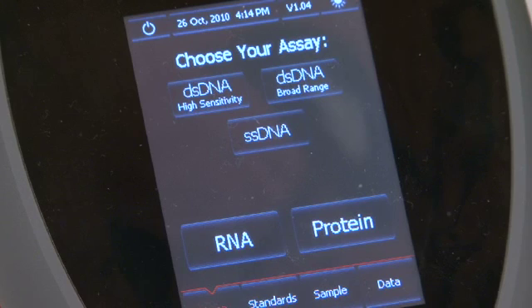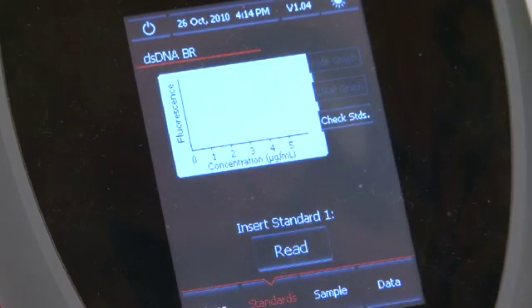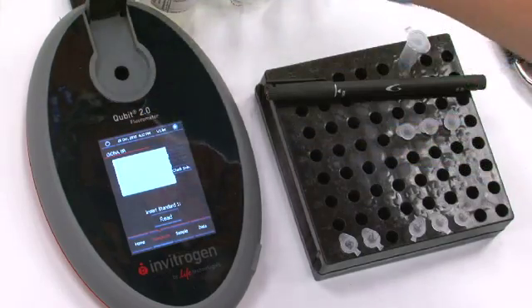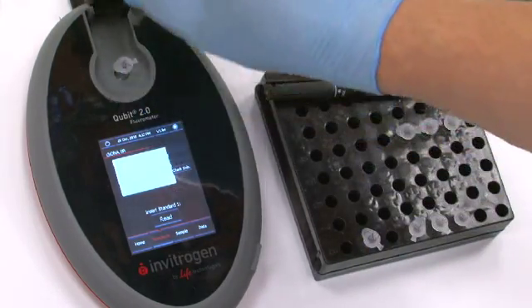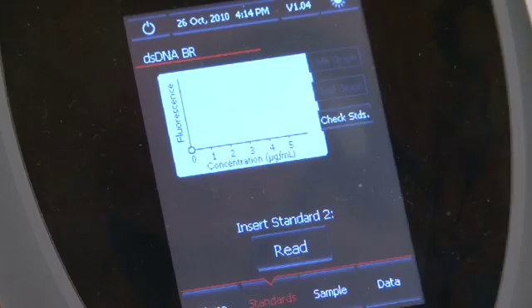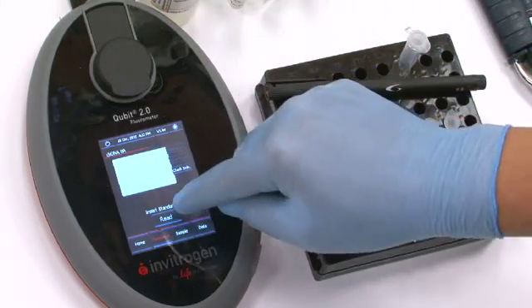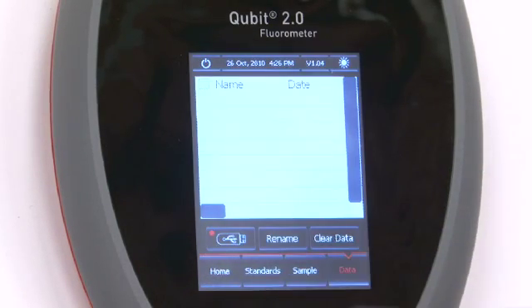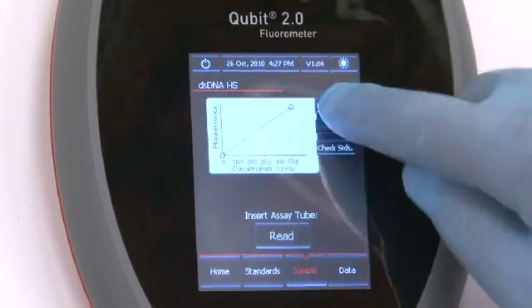You will have the choice between different ways to quantify DNA: double-stranded DNA in high-sensitivity mode, double-stranded DNA in broad-range mode, or single-stranded DNA. In our case, we will use the broad-range mode. The standard screen is automatically displayed. Insert standard number 1 in the sample chamber and press Read. When the reading is done, you will be prompted to insert standard number 2 and press Read. The Qubit 2.0 fluorometer is very simple and intuitive — it will guide the user through all the measurement steps.